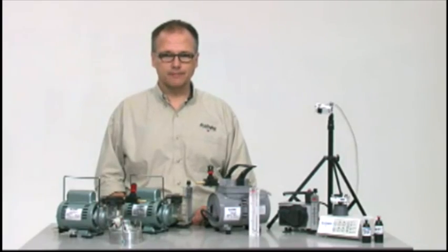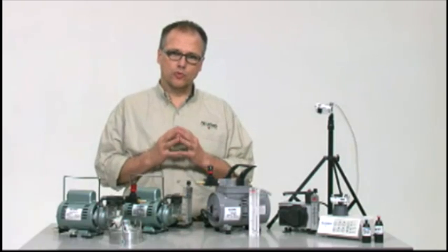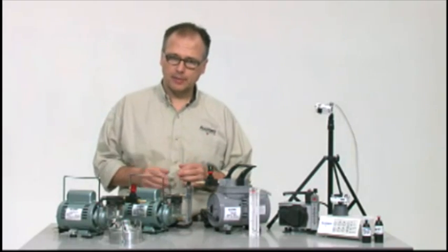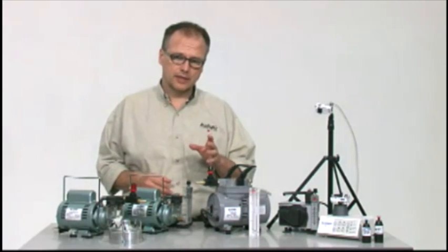Hi everyone, Allegro Isle here. Today I'm going to give you some great information on a variety of sampling products used in the environmental industry.